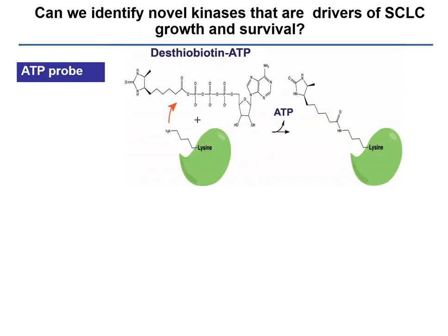So we applied activity-based protein profiling to study small cell lung cancer. Here is the probe. The designed ATP binding probe can specifically bind the ATP active sites of enzymes, including kinases and metabolic enzymes. The binding can modify the conserved lysine in the ATP pocket.